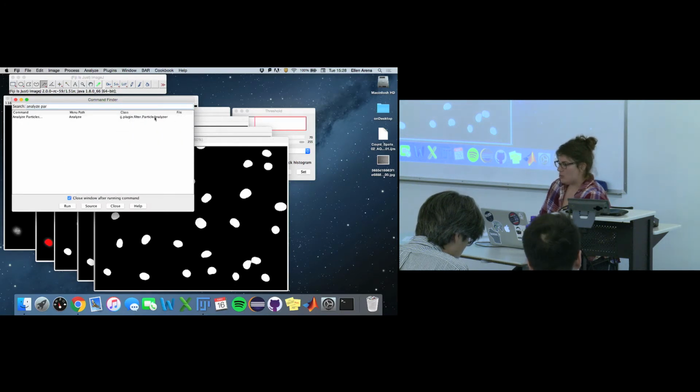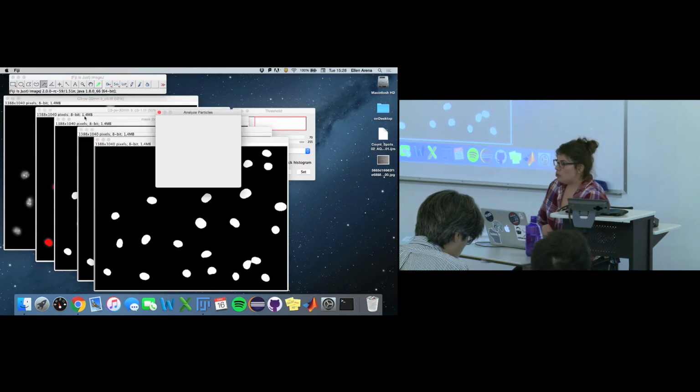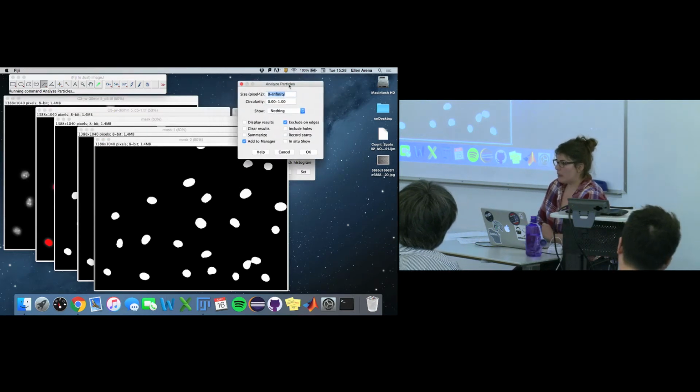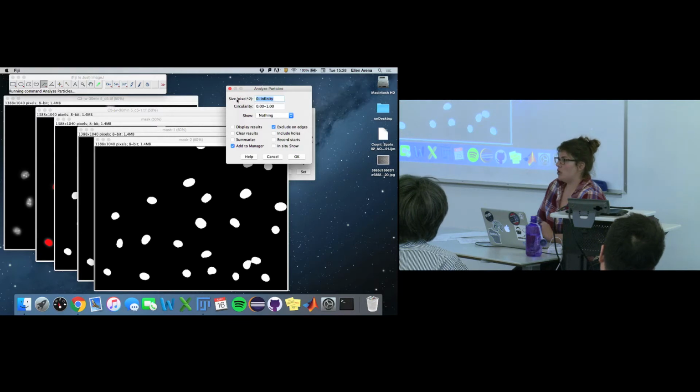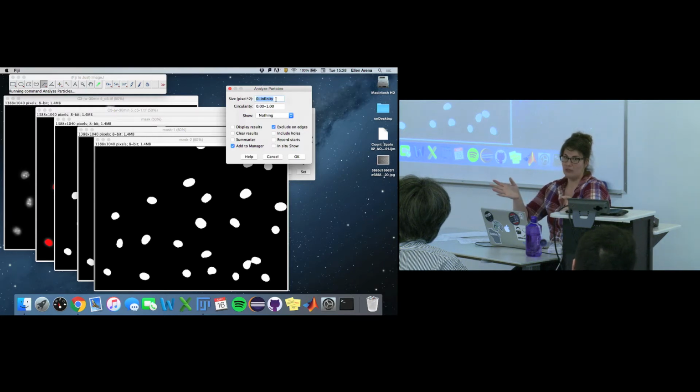Now you'll see the whole idea of this is to select our objects. We have 2 filters that we can set right away. We have a size filter, in pixel squared. Right now it's in a range from 0 to infinity. If your biological question has to do with the variation of size of objects, you might not want to set up a filter right away.